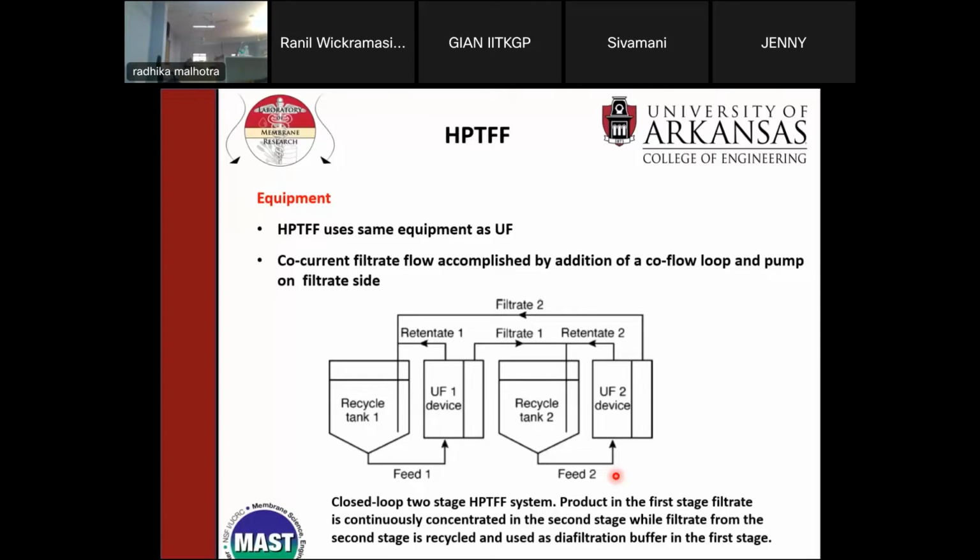The retentate from that comes back in here, and then the permeate from here. So basically you can link these two, and what you end up doing is concentrating things in here and concentrating things here. Like this, you can cascade, and you can develop cascades like this to fractionate many different proteins of different sizes.